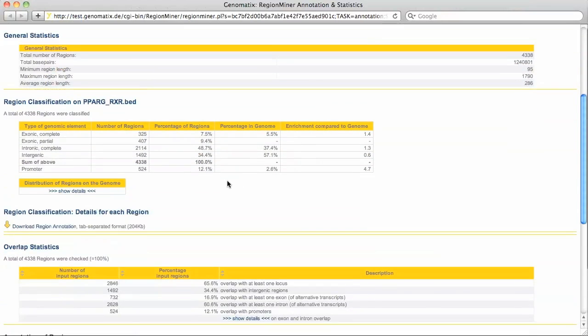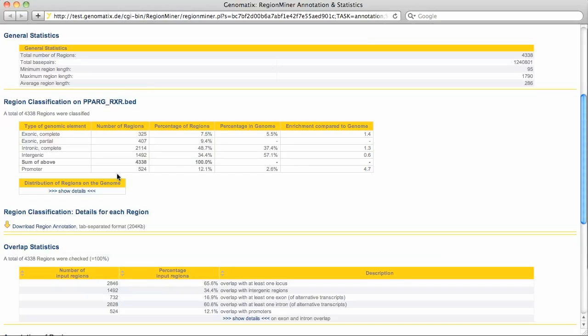On the result page we get some statistics, for example a classification of the binding regions. About 12% of the PPAR gamma RXR regions overlap with promoters. As only 2.6% of the mouse genome are annotated as promoter region, this corresponds to a 4.7 fold enrichment of binding regions in promoters.